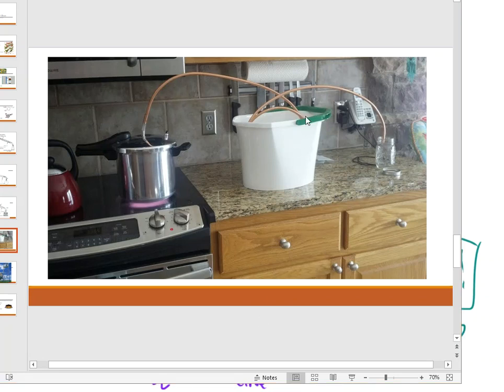So over in the white bucket, this is where they basically would keep some ice. And this is a circulating coil that will go through those really cold temperatures, and that will condense and recirculate the vapors that basically go into this coil and cool back down, which will be collected into the collection jar over on the right-hand side. So this is your homemade version of a steam distillation, and it will probably actually be a little bit easier to set up and probably work a little bit better than the setup that we're going to be using in the lab. So keep that in mind. You can home make these things if you need to, and if you want to extract your own essential oils at your home.